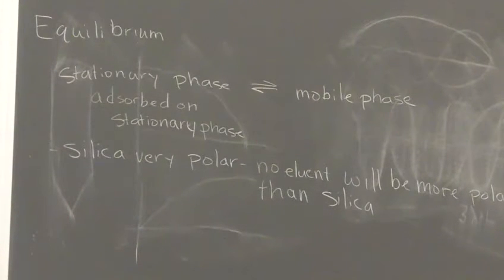So what you're going to have is the TLC plate is going to be something like this, okay? So you're going to get plates that have already been cut for you. You don't have to cut them.